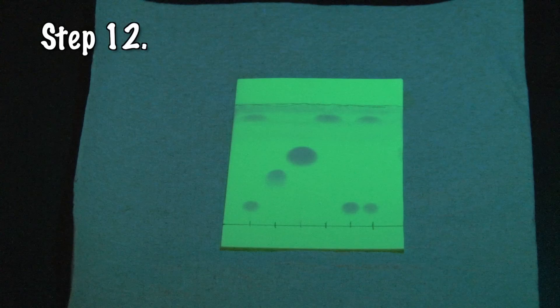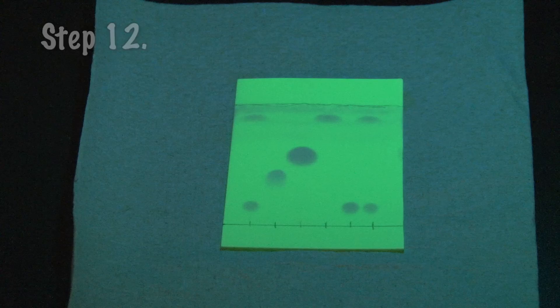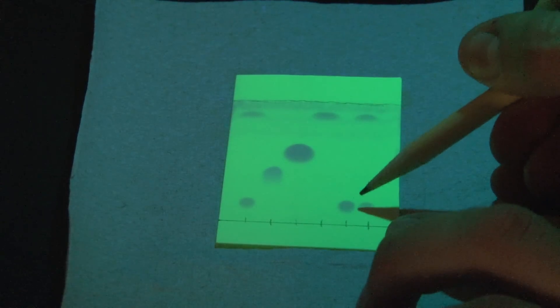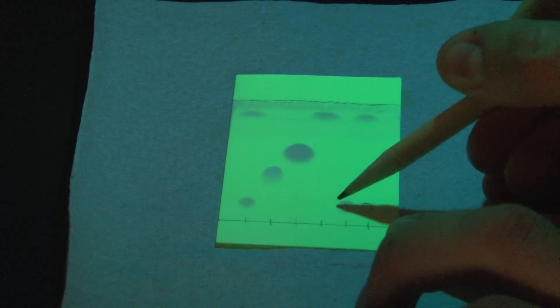Take your developed sheet and again view it under UV light. You should now be able to see how the spots migrated up the plate from their original positions. Circle them with a pencil and return to the lab.